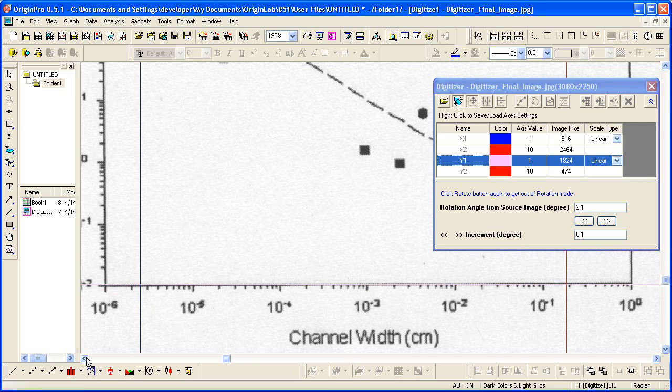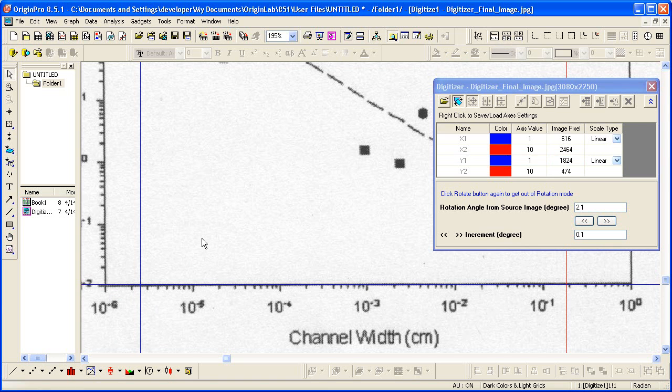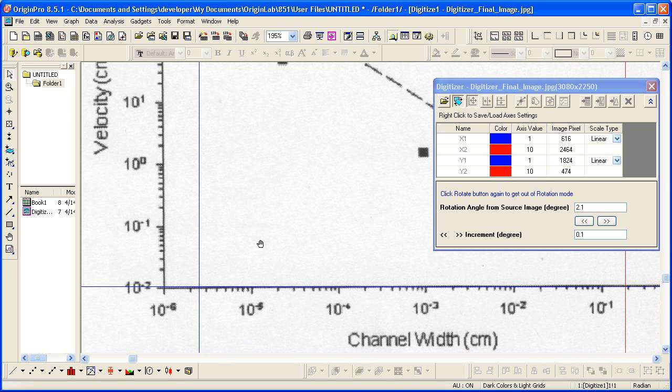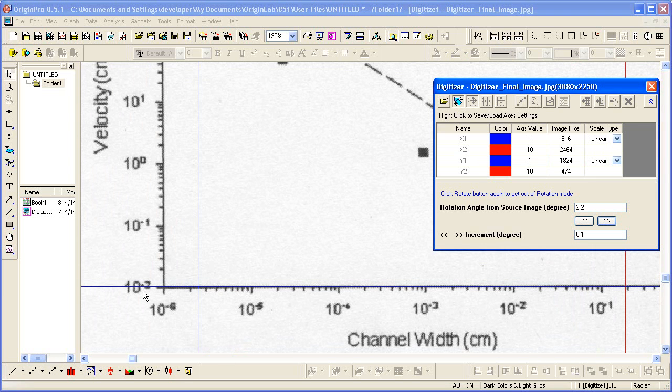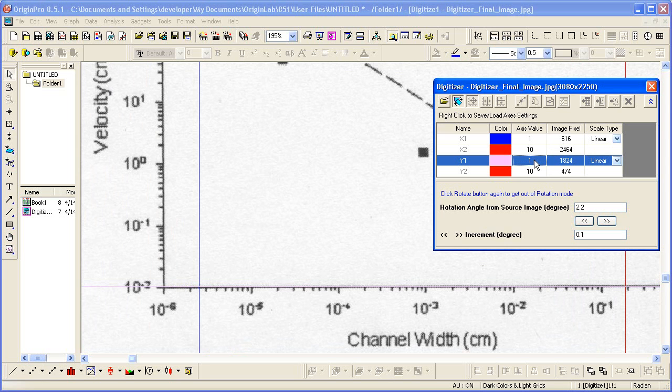Once that's lined up, we then need to specify the axis value. So that's located at 10 to the minus 2. So Y1 here is 1E to the minus 2.